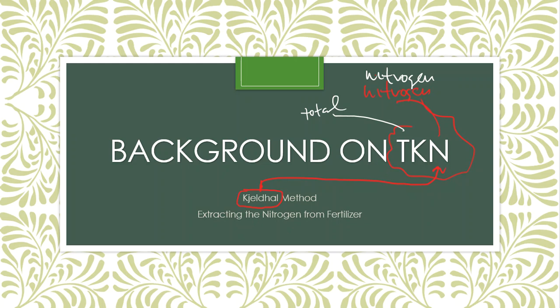So we're going to get you to go through the TKN process, and keep in mind that you probably are going to see this again, especially in our food chemistry class, where we begin to talk about how they calculate the protein content of food items, because protein is loaded with nitrogen. And if we have an idea of the nitrogen in the food sample, then we can also have an idea of the protein amount in the food sample as well.